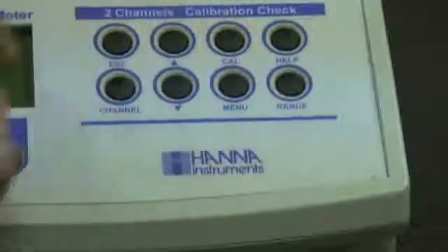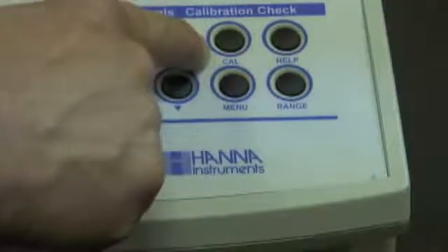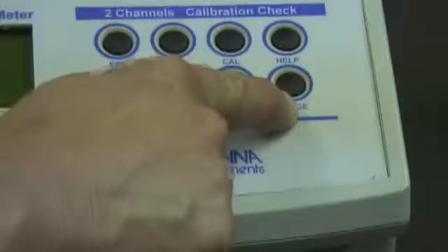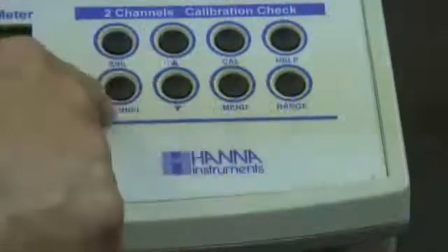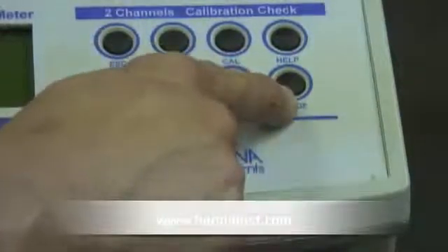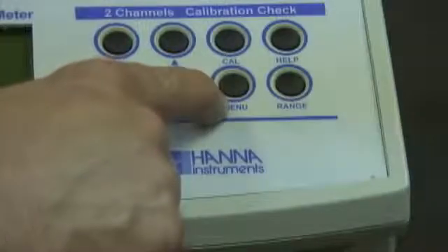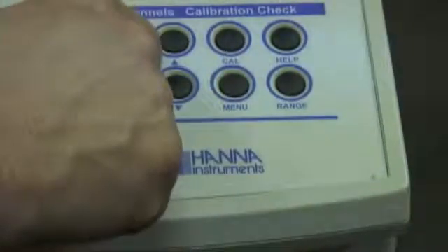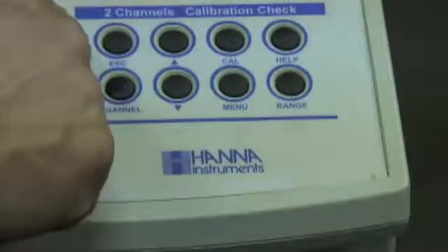First of all, we have the help button. If you're working on the meter and you ever get lost with whatever screen you're in, you can simply push the help button and directions will be displayed on the LCD screen. The calibration button takes you right into calibration mode. The range button — for example, if you're on channel one and you want to go back and forth between pH and millivolts, you simply hit the range button. When you hit the channel button and go to channel two and want to switch between ISE and millivolts, you do the same thing. We have a menu button which displays information for the virtual keys, simple up and down buttons which move you around the screen, and an escape button if you need to back out of a particular screen.